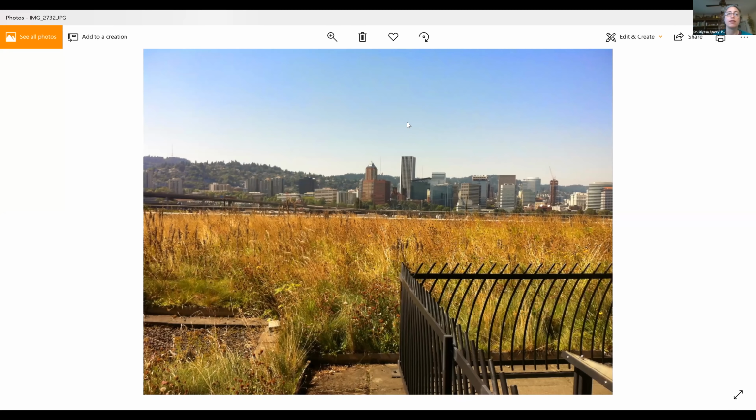And as you can see, there's quite a variety of plants used. Here, there's a lot of grasses, which are C4 plants primarily. But another genus that is typically installed on green roofs is Sedum. As many of you are aware, Sedum are primarily CAM plants, which means that they open their stomates at night so they can conserve water during the day.